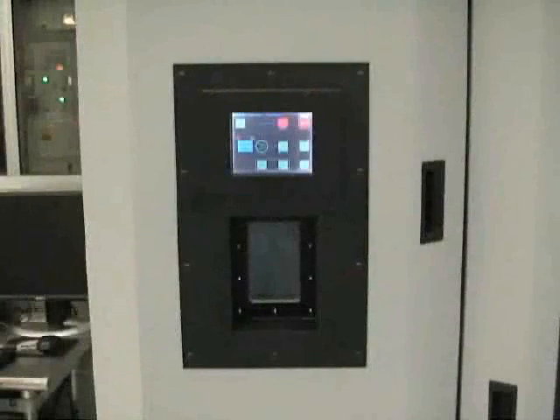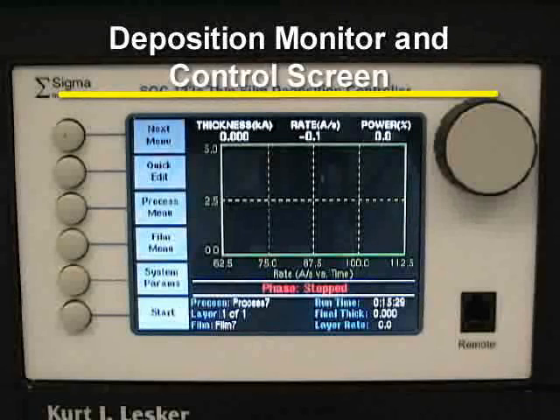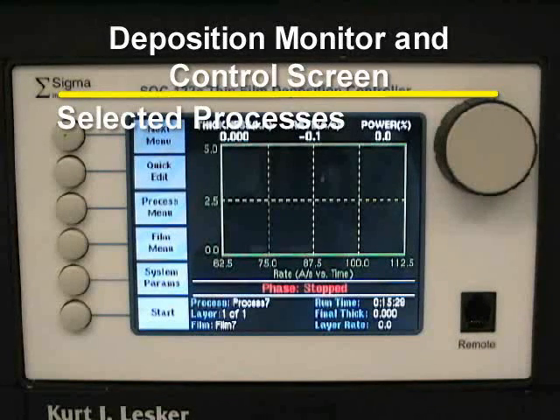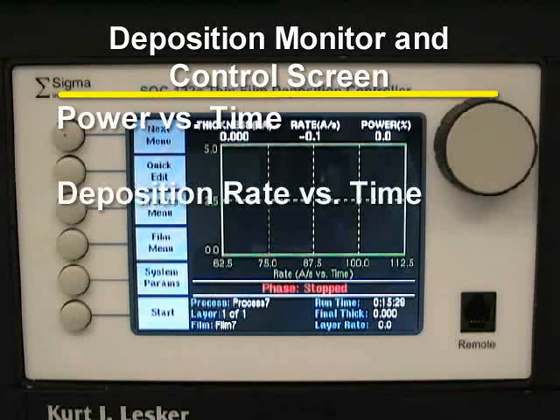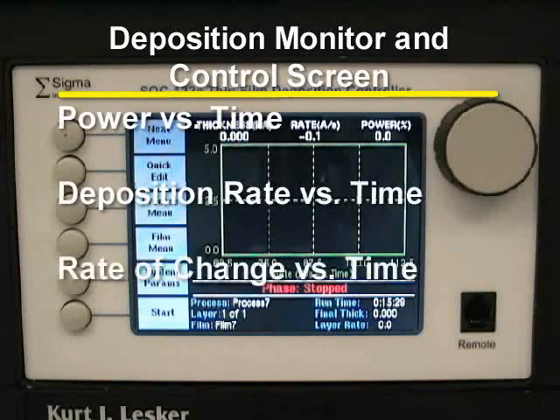The front panel touch screen is located directly above the chamber viewing window. The deposition monitor and control screen is where the processes and films are selected, edited, and displayed. It shows the processes selected, types of films being used, and displays different graphs during deposition. These graphs include power versus time, deposition rate versus time, and the rate of change of the deposition rate versus time.